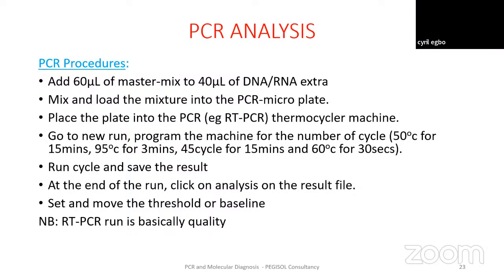So after putting this mixture into the PCR microplate, you place the plate into the PCR machine. It may be multiplex, it may be real time. Then after which, you go to run, you program the machine.